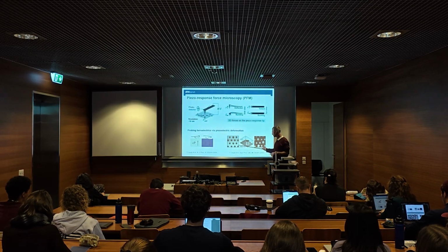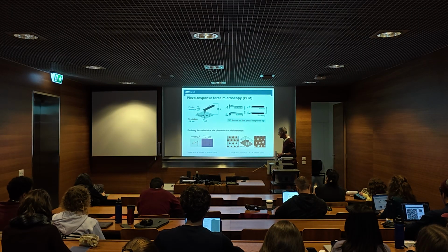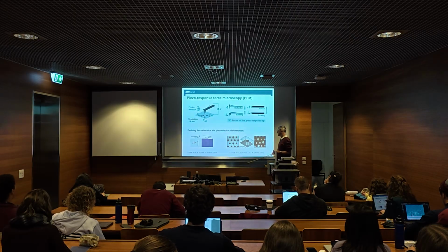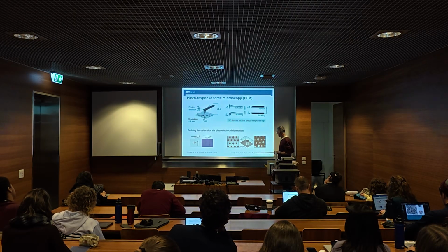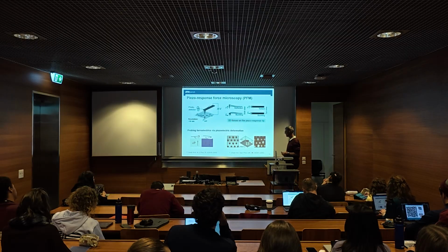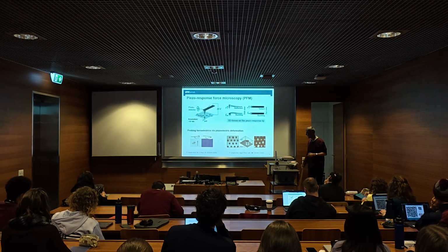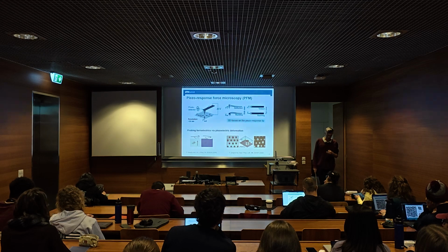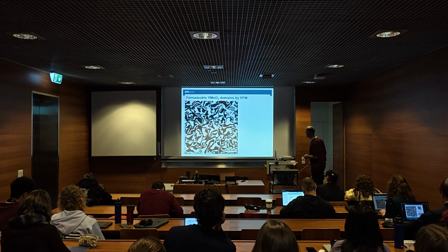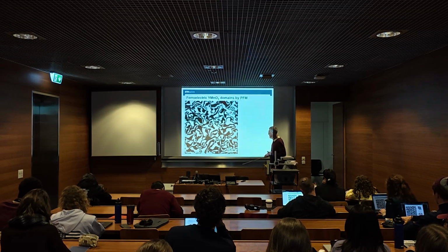And then you can very nicely, for example, scan the distribution of plus-minus polarized domains on the surface of a lithium niobate crystal. In this particular example, they showed that here they form bubbles, here they form hexagons. On the bottom, hexagons, and on the top, bubbles. So this kind of stuff you can do. It's very powerful.